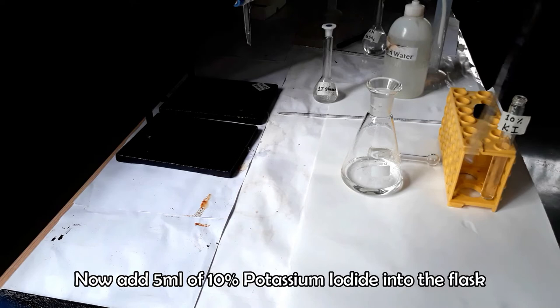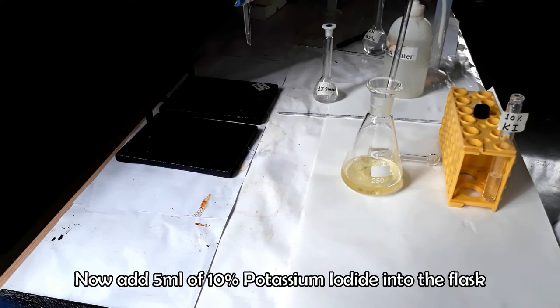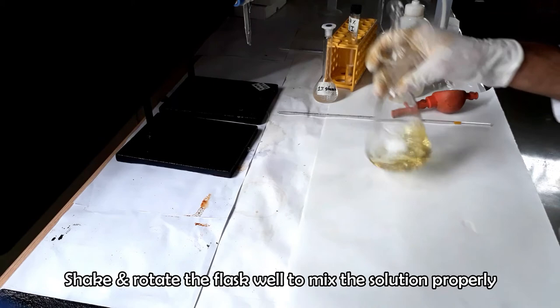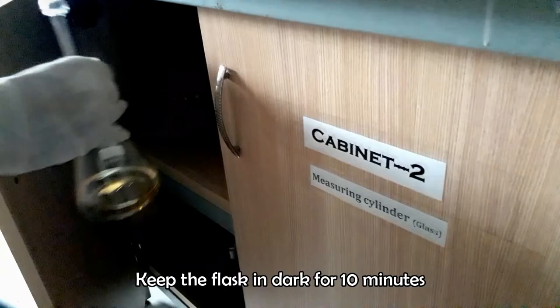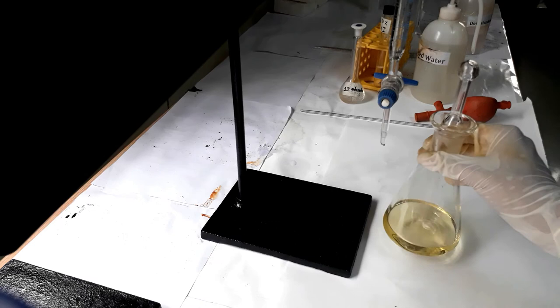Add 5 ml of 10% potassium iodide into the flask. Shake and rotate the flask to mix the solution properly. Yellow color solution will appear if iodine is present. Now, keep the flask in the dark for 10 minutes. After 10 minutes, bring the flask back for titration.